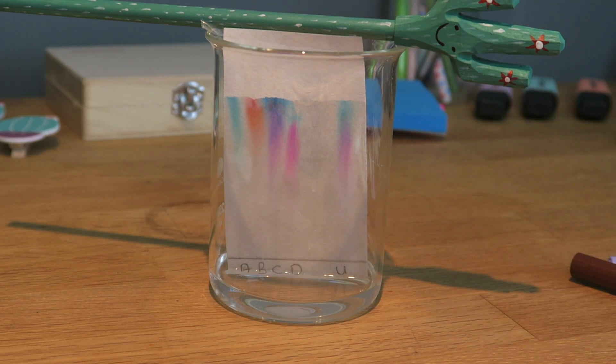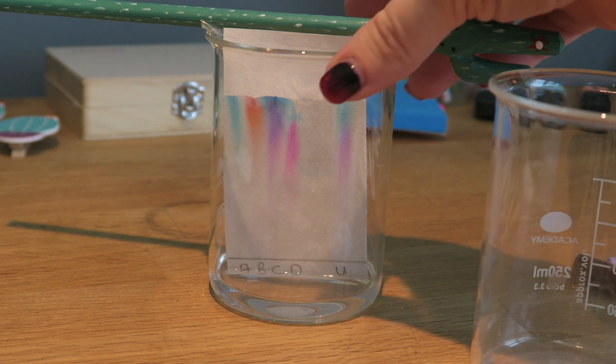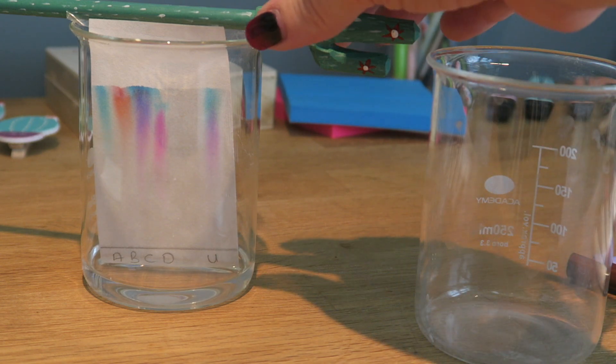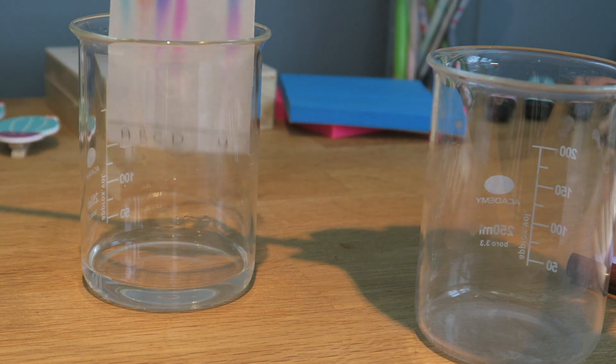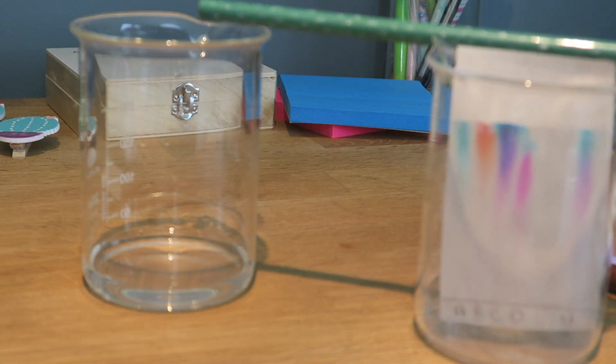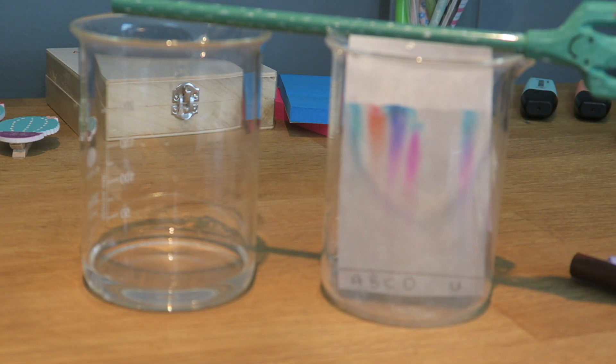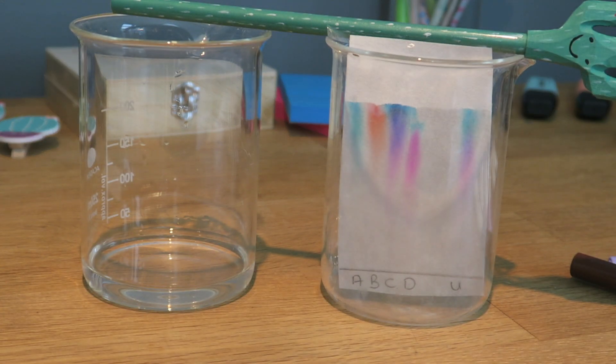When the solvent front gets nearly to the top we can stop the experiment and look at the results. I'm going to stop it by moving the chromatography paper out of the liquid and leaving it in there to dry. You can leave it for some time to dry or you can use a hairdryer to help it.